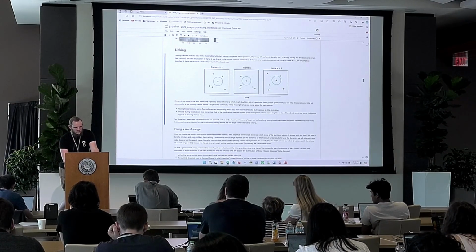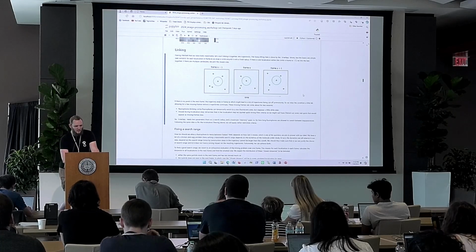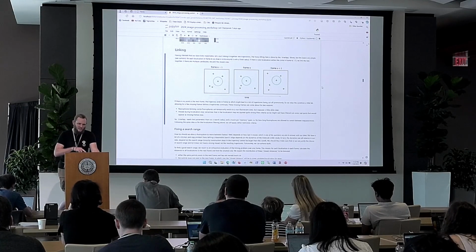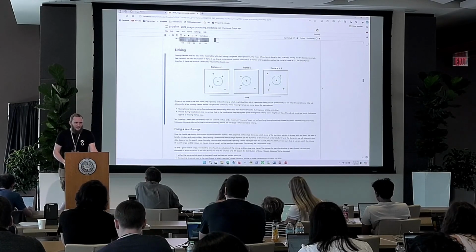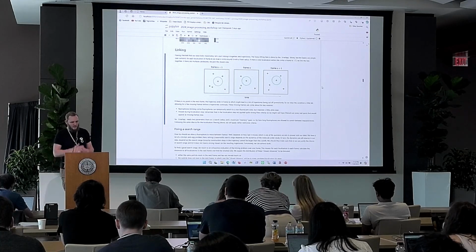The other issue that could happen: now we went through what happens if you have exactly one localization in this cutoff radius, and what happens if you have more than one. The next thing is what happens if you don't have any. Then you lost track of your particle, so the trajectory ends, and you just cut it off there.